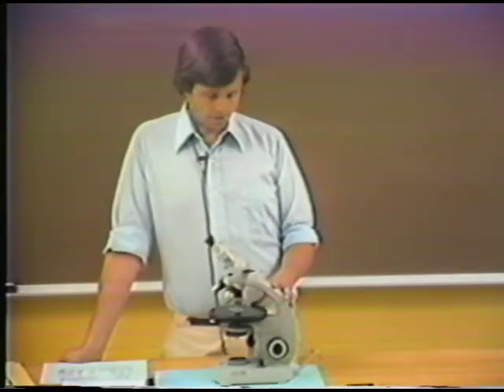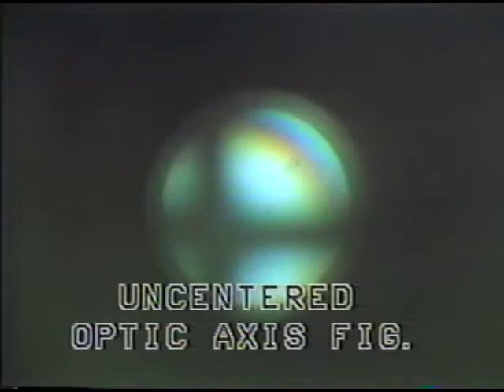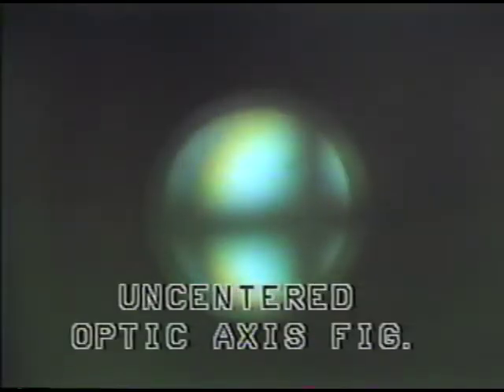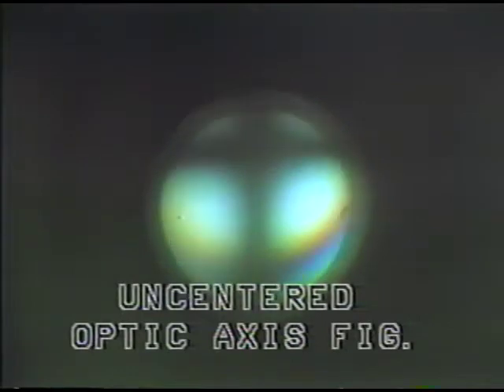So first of all, this is again a mount on a thick section of quartz, and so there are some color curves that show in this mount. What we see here is an uncentered figure, a typical uniaxial uncentered figure, and now we can see the two isogyres crossing in the field of view, but the point of intersection is not at all centered on the crosshairs of the microscope. In fact, you can see that it rotates and migrates around the field of view as we rotate the stage of the microscope. So this is an uncentered optic axis figure of a uniaxial mineral.